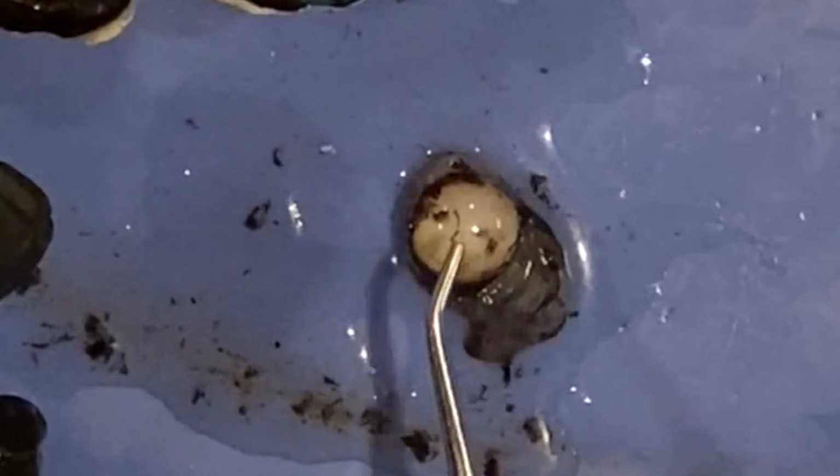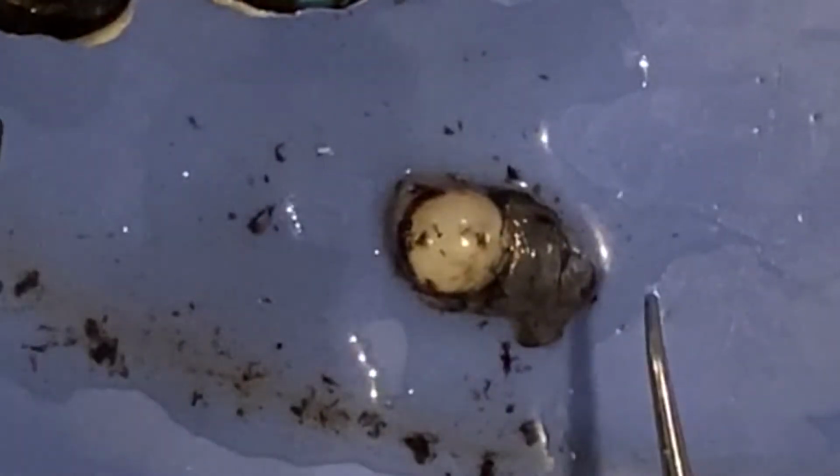So I'm going to set the lens down here and make sure that we can focus on it for a moment. The lens reminds me of a marble because of how hard it is, but this is actually flexible, and it helps with near point accommodation when you're trying to see things up close. And if you're trying to see things further away, it stretches out more. So there is some flexibility to it.